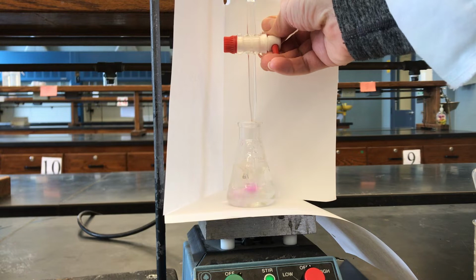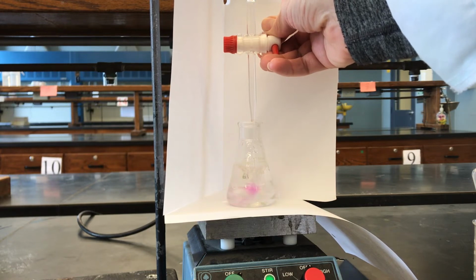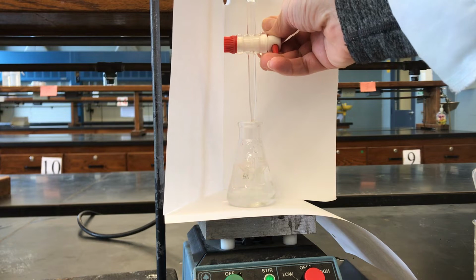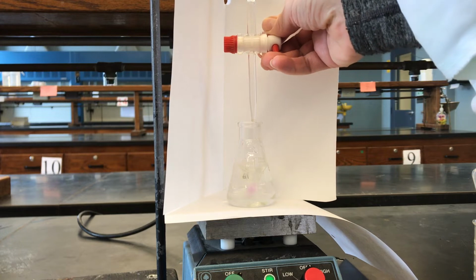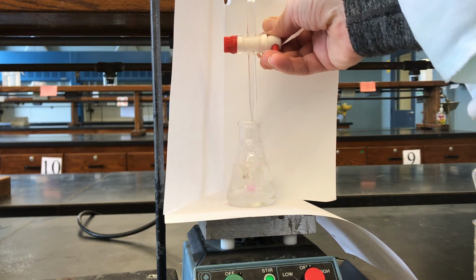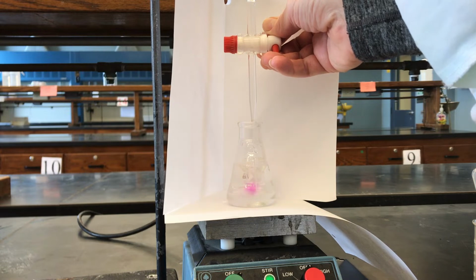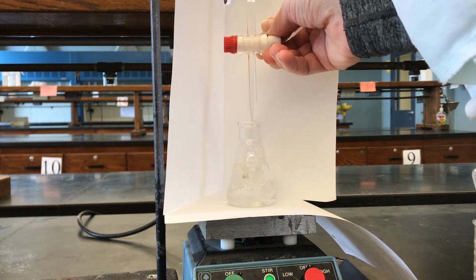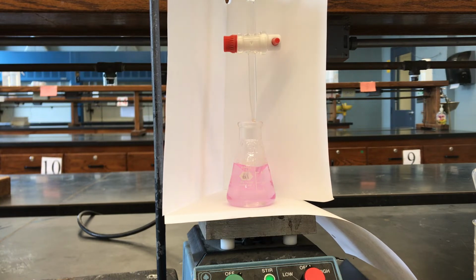Because what we want to do is capture the point in time when that last drop enters and turns our solution a pale pink. So we're just going to be patient. It's really very pretty. It's a very beautiful color. So you can see the pink's taking longer to disappear now. So I'm getting ready to turn this off. There we go. We got that last drop in, and we have that beautiful pale pink color.